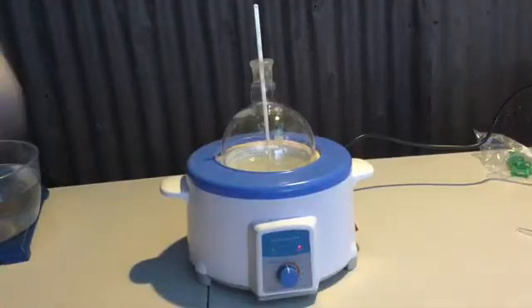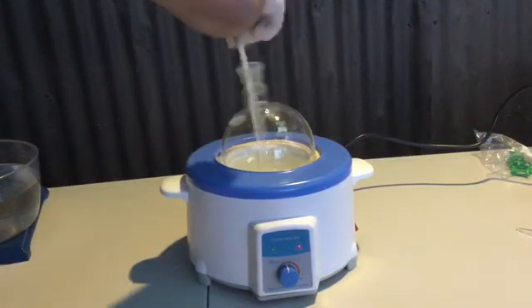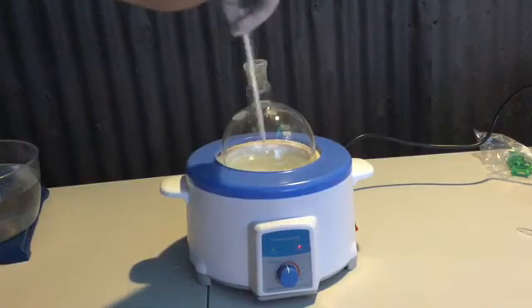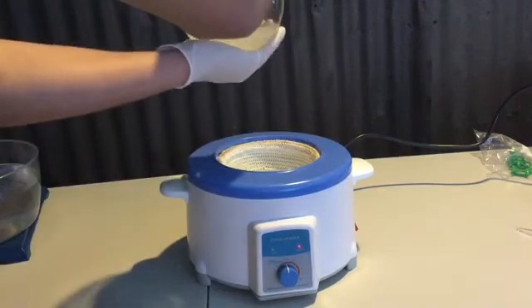After cooling, the flask was then placed back on the heating mantle and the temperature was set on medium. I'm using a plastic chopstick to mix the solution, which is not very professional; however it worked well for mixing. If you have a stir bar on hand, it will be much more efficient.